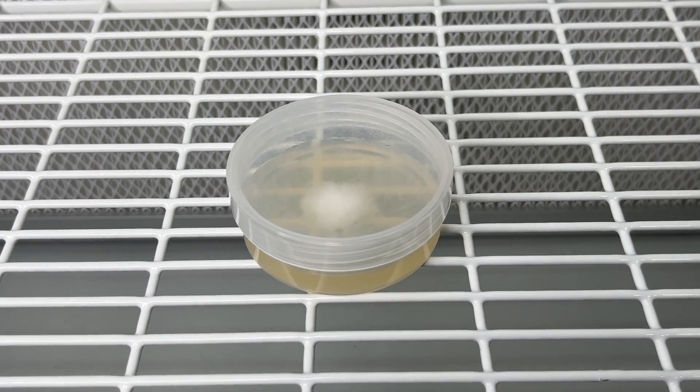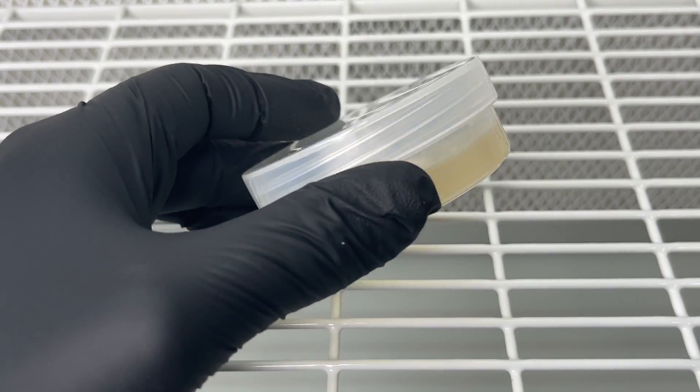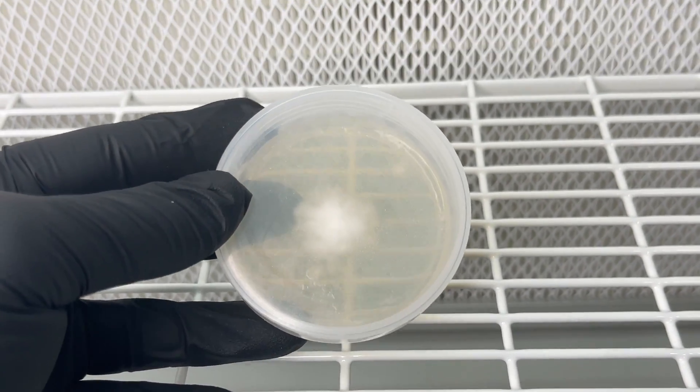Welcome back to Spore and Sprout. In this video I'm going to show you how to make unmodified, no-pour agar plates, and the best part is you don't need a laminar flow hood or a still air box to make them.